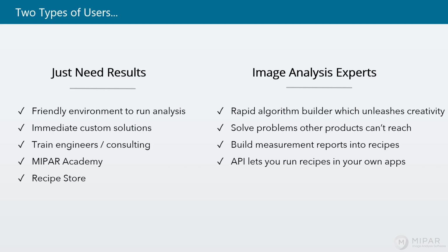As I've mentioned, there's absolutely no coding involved in any of the algorithm creation in MIPAR. It is a purely graphical, interactive algorithm building environment, and that toolbox combined with a resource like the MIPAR Academy has been shown to be incredibly educational in raising the experience level of our users.